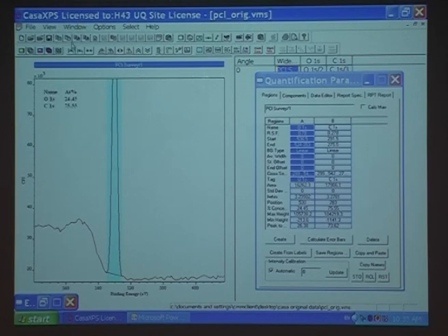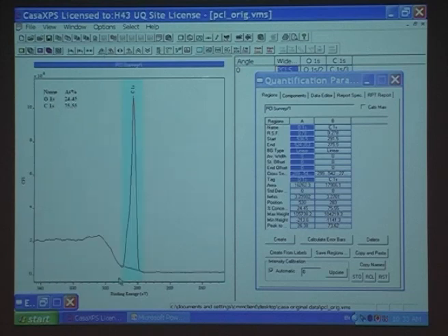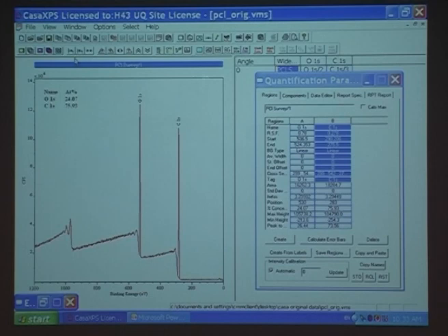Now I can move down the spectrum in the zoomed in mode by stepping right. And I'll come down eventually to the carbon and say, oh, I could adjust that a little bit. Okay? These have changed just fractionally, and I'm satisfied with that now. So that's finished. The survey's finished. I can zoom out and say, good, that's finished.